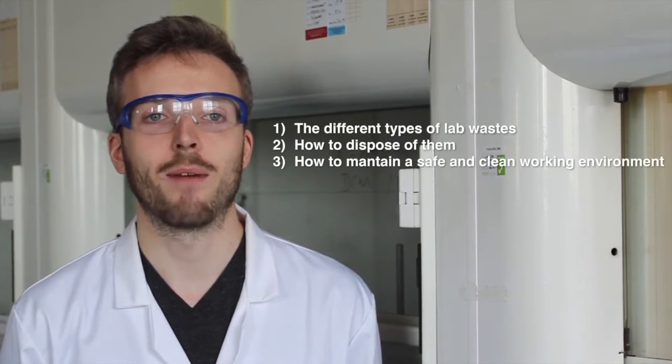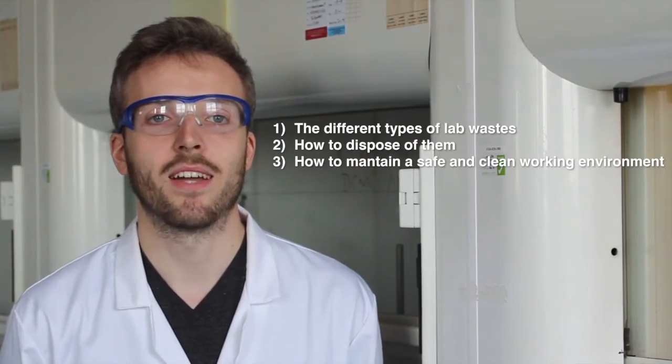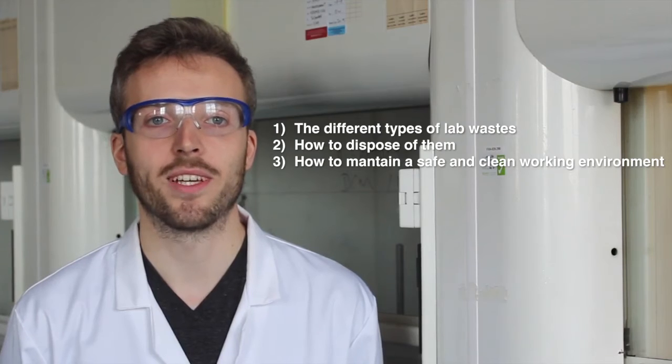In this video we are going to show you how to dispose of all the different sorts of waste that you might produce by performing your research in our laboratories. By the end of this video, you will have learned about the different types of lab waste, how to dispose of them, and how to maintain a safe and clean working environment. We will start by showing you each waste station separately, and then we will walk you through the necessary steps and the precautions to keep in mind when you dispose of your chemical waste or used equipment.